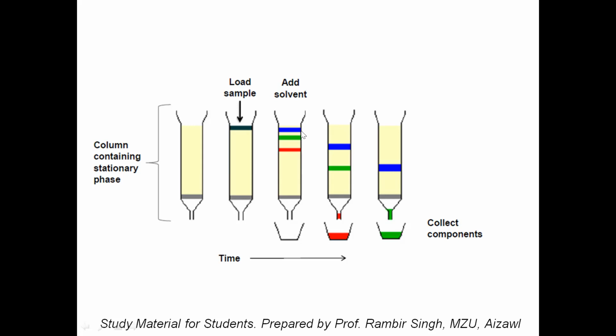No, I'm giving you a hint. Eluent, solvent. Sir, the mobile phase. Yes, very good. So eluent means the mobile phase under the influence of which the elutes are coming out. Because the mobile phase is moving, the eluent is pushing the elute out of the chromatographic system, whether it is a column or a TLC system.